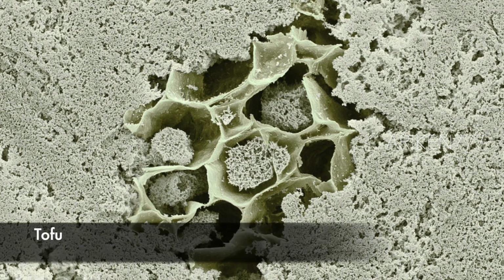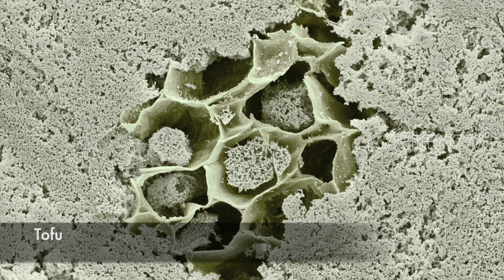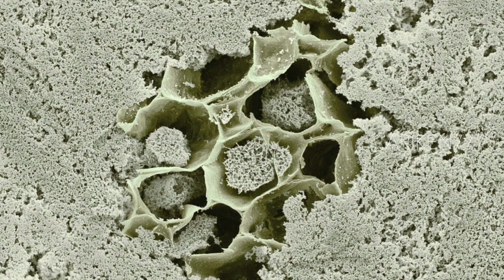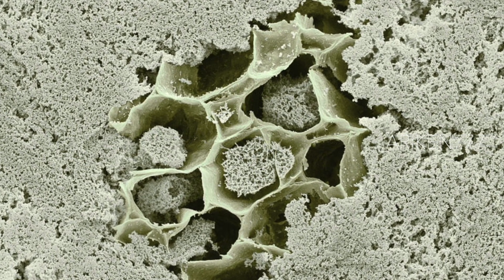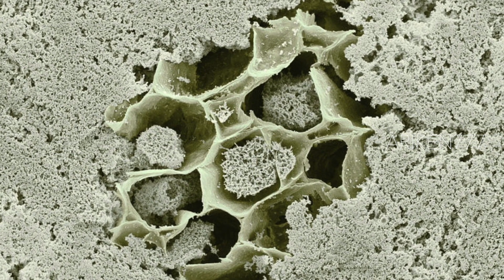This is tofu, showing the microstructure of coagulated soy milk proteins. A minute particle of the soybean consisting of cell walls filled with tofu indicates that this is a product made from a plant source.